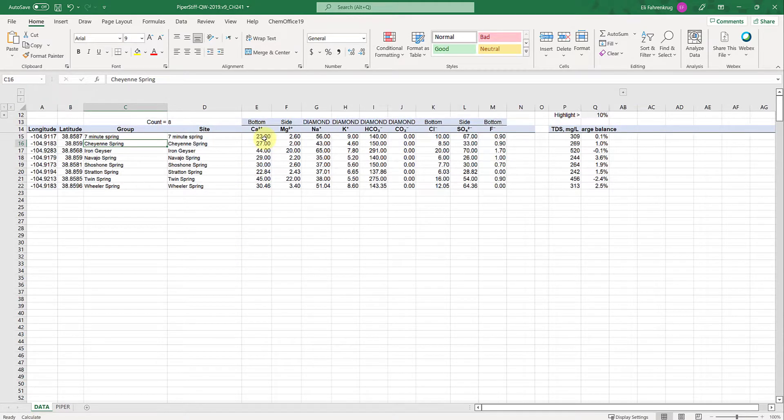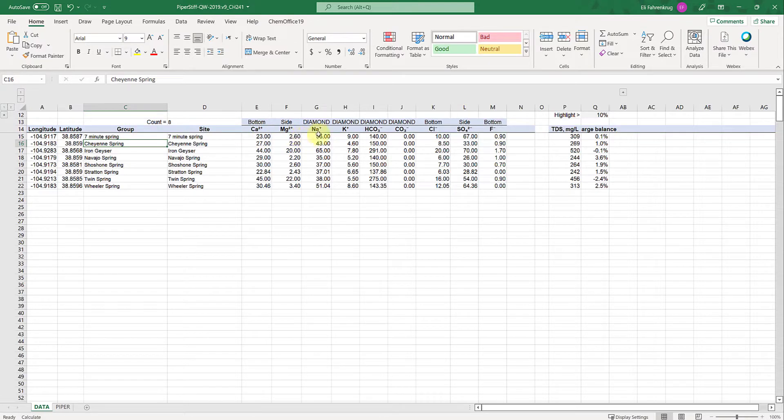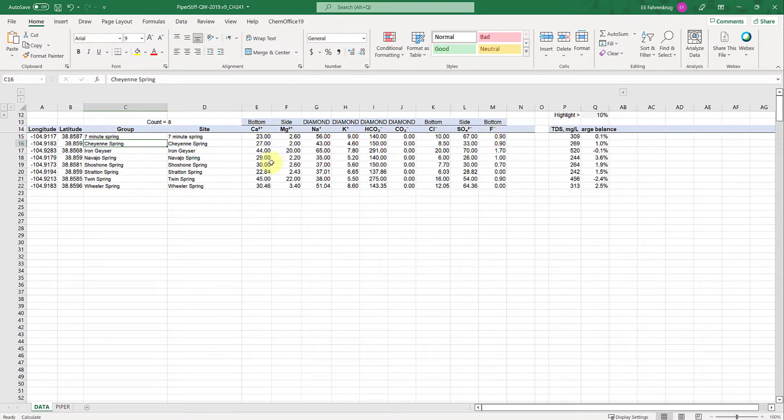You need to input the concentrations of calcium, magnesium, sodium, potassium, bicarbonate, carbonate, chloride, sulfate, and fluoride in this spreadsheet for each of these samples.